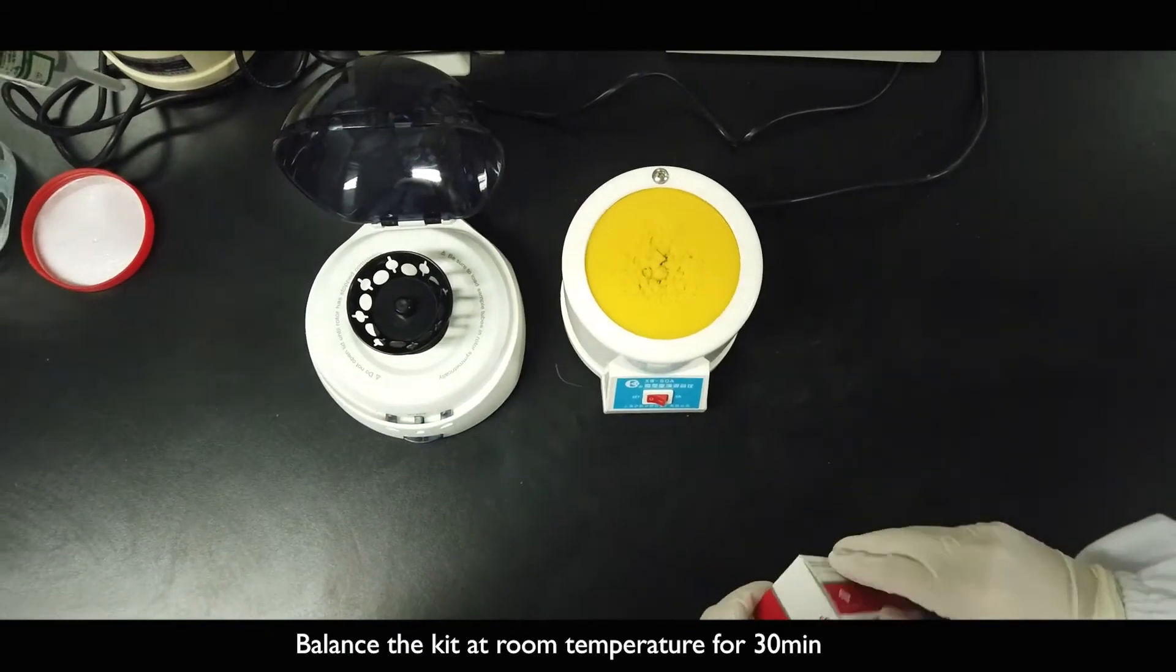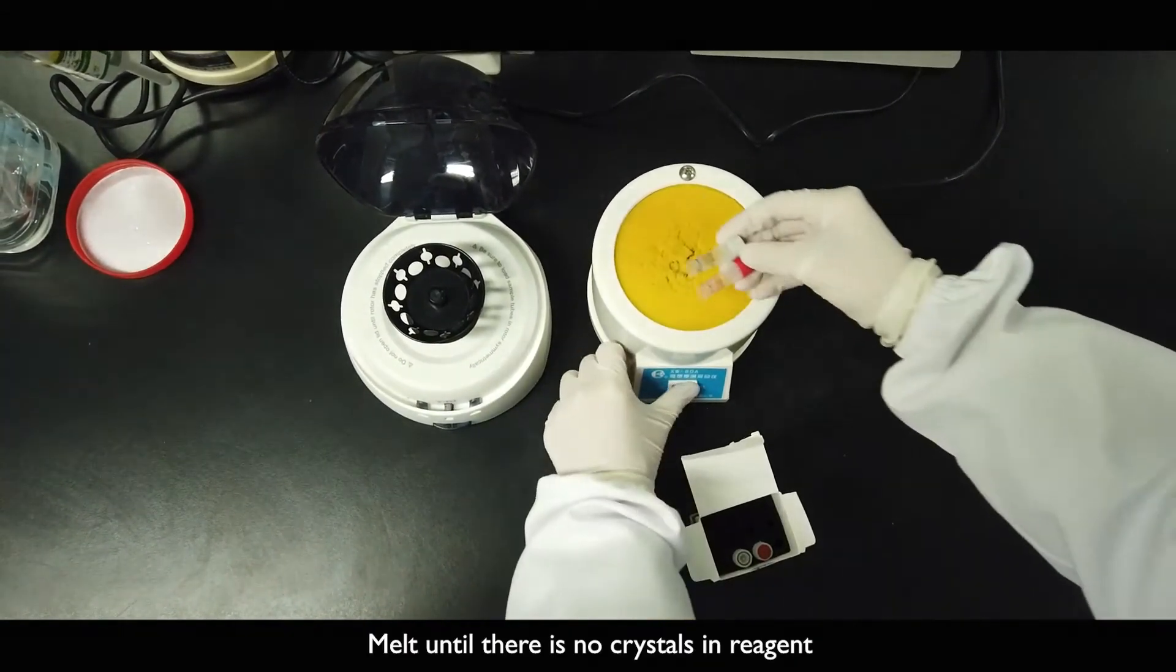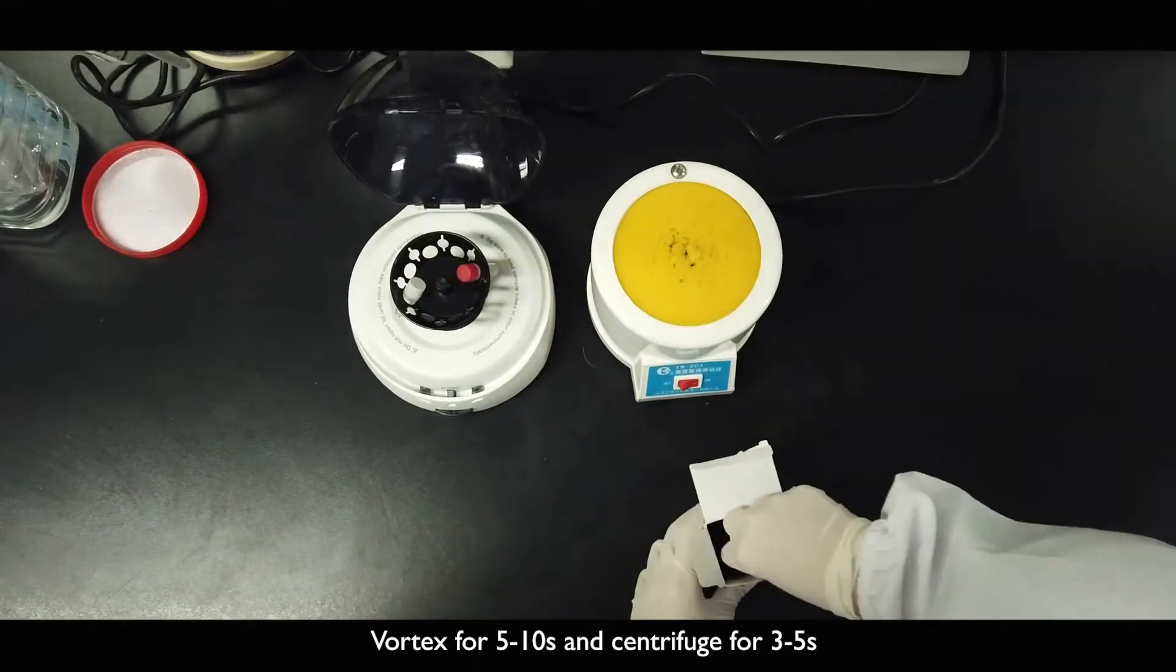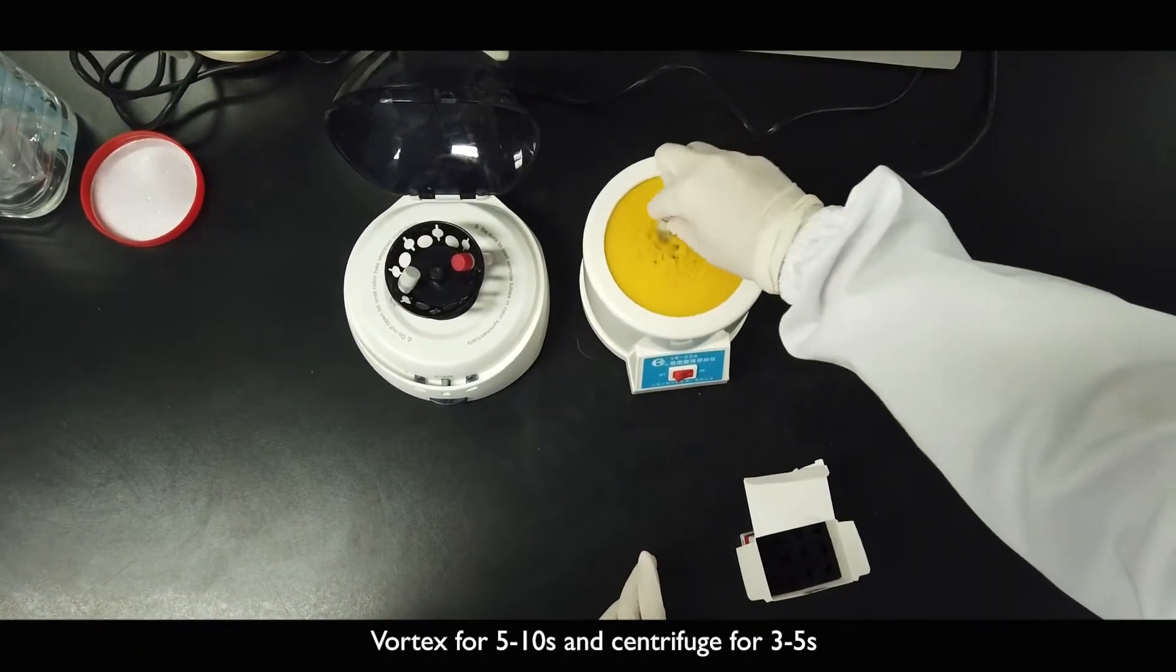Balance the kit at room temperature for 30 minutes. Melt until there are no crystals in the reagent. Vortex for 5 to 10 seconds and centrifuge for 3 to 5 seconds.